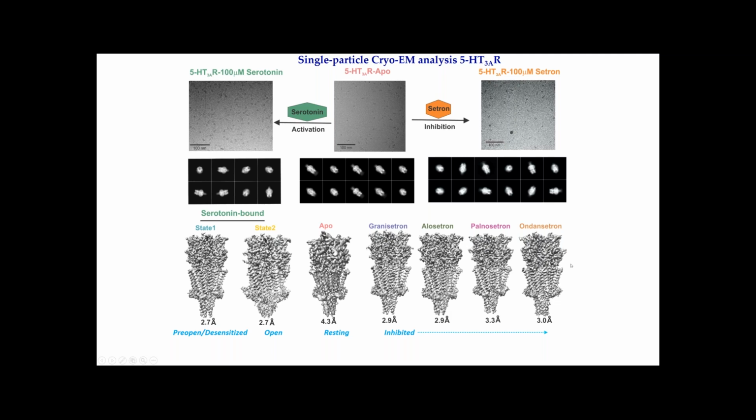All the setron-bound structures right here and those of serotonin-bound structures were all imaged using our K3 camera with a BioQuantum energy filter at Case Western Reserve University.